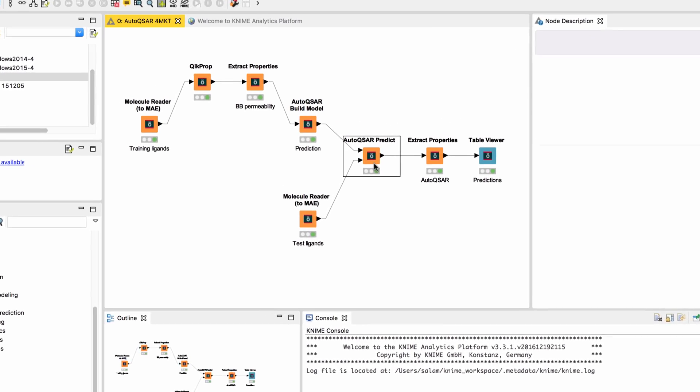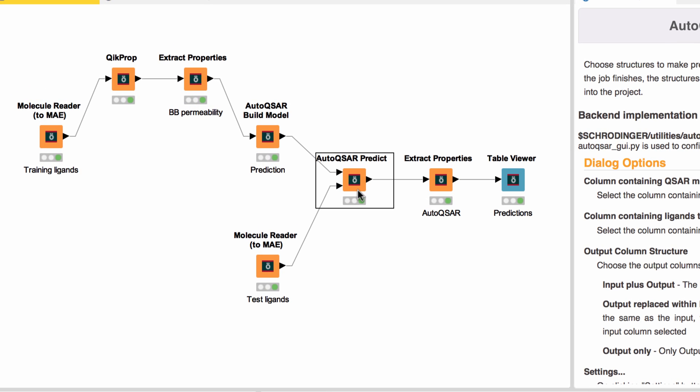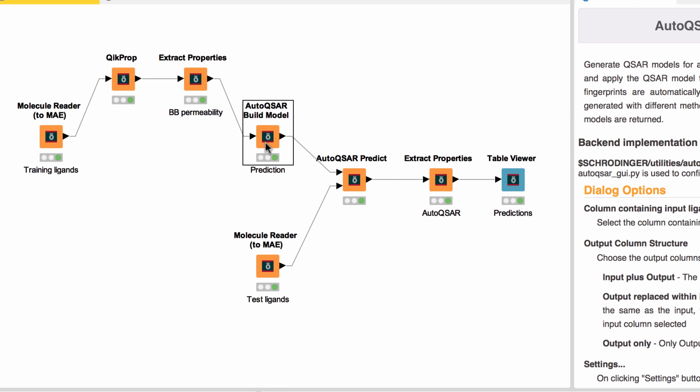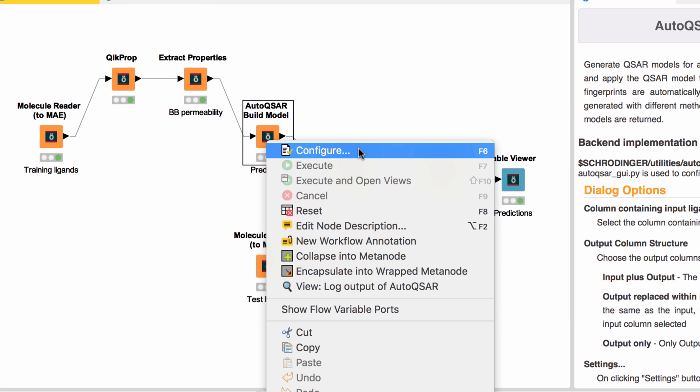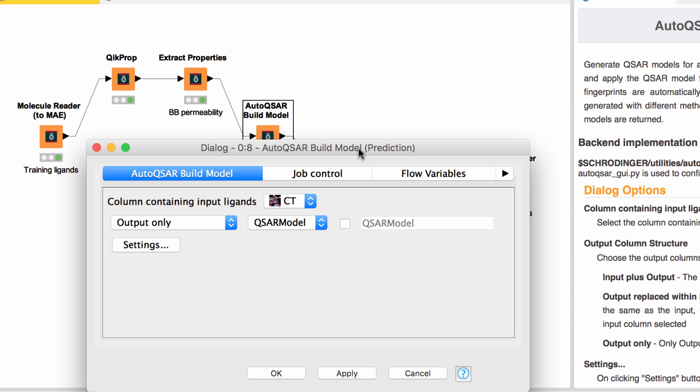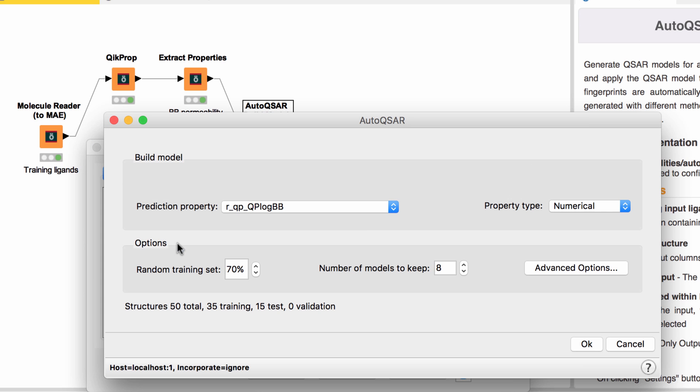Over in KNIME, Auto-QSAR nodes are now available, allowing for the quick setup of Auto-QSAR workflows with the same settings as those exposed in Maestro.